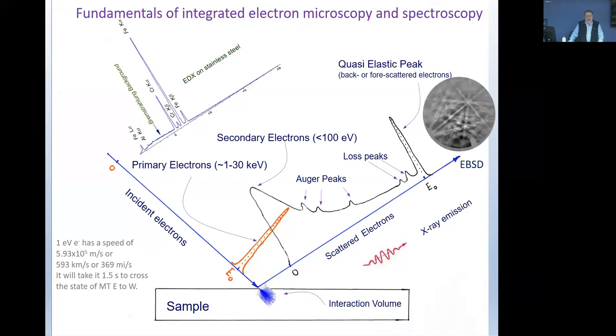Actually, I should have mentioned it now that Robin is in the audience. So EDS and X-ray spectroscopy is not for trace element analysis. You have to go to the next level for that. So it's ICP-MS, laser ablated mass spectroscopy technologies and things like that can do sub-percentage, even part per million to billion to trillion. But in EDS and X-ray analysis, we are talking about maybe a couple percent. So you're in the gray area.